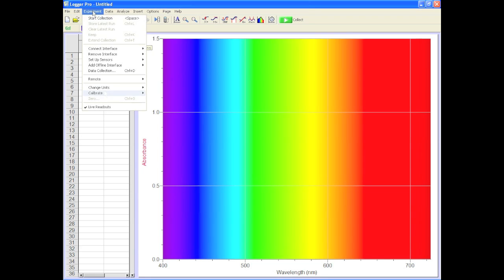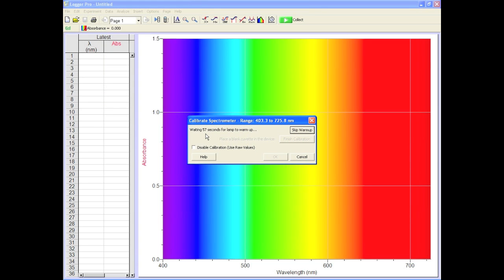On Logger Pro, select Experiment, Calibrate, Spectrophotometer. Now you gotta wait for it to warm up for a minute. When it's done, press Calibrate now and in a few seconds press OK.